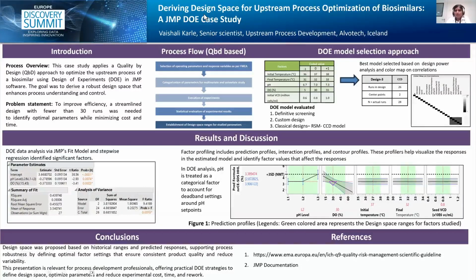The central composite design was giving us a total of 26 runs with 2 center points, and 28 final runs or experiments, which we thought gave us more scope for analysis of the design.